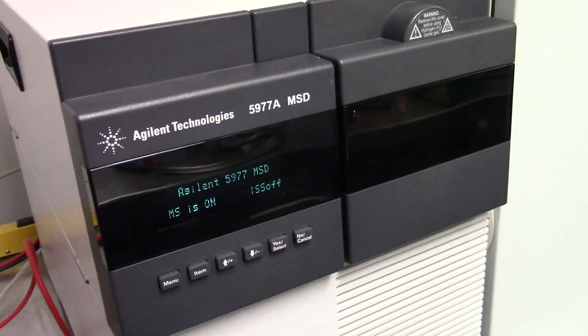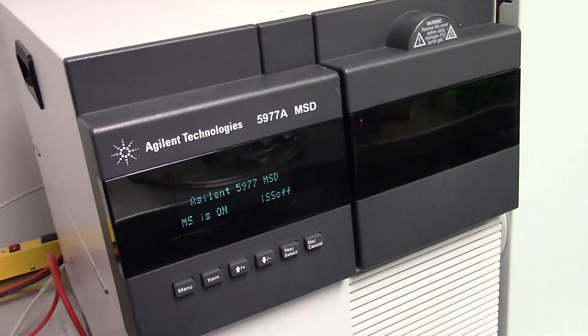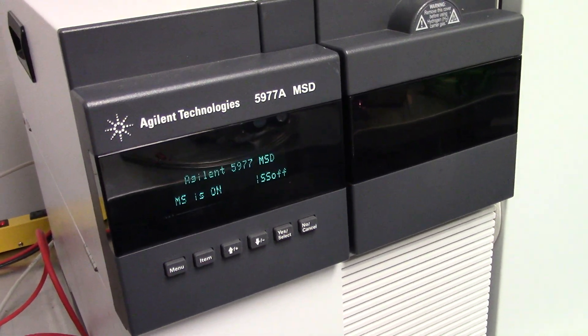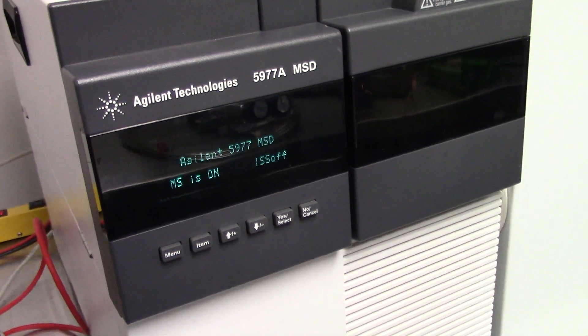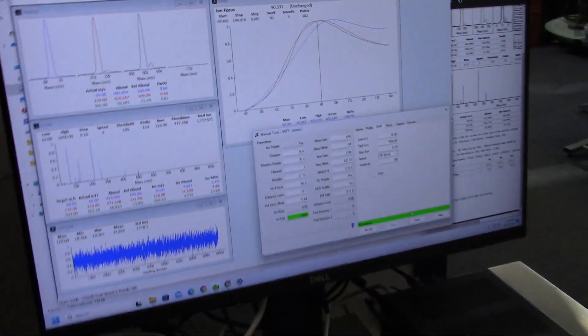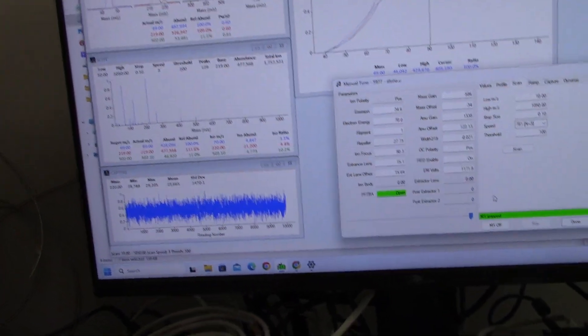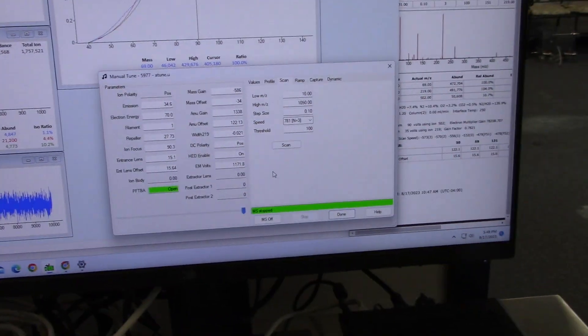In this video we're going to be concentrating on the mass spec detector. The instrument is live. I'm going to perform a scan right now.